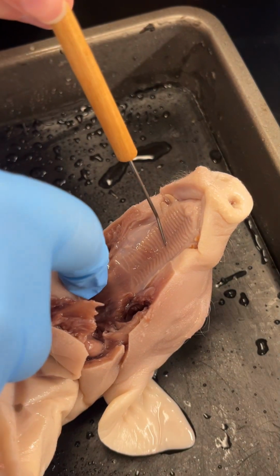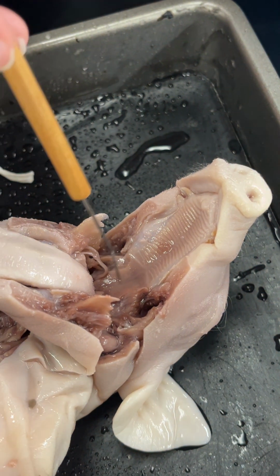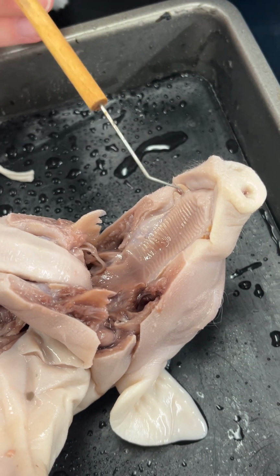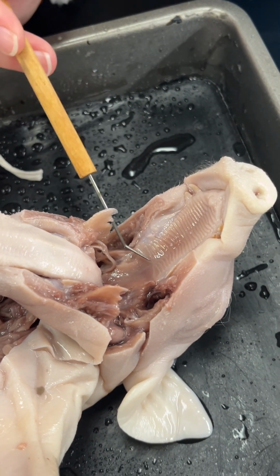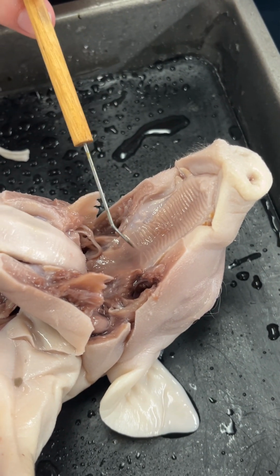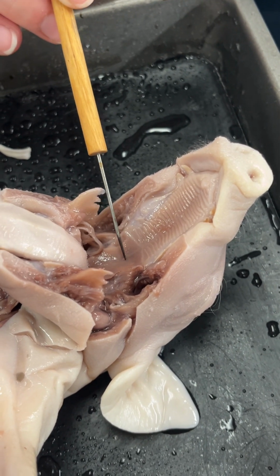This is the hard and soft palate. The roof of the mouth is formed anteriorly by the hard palate, supported by bone and cartilage, and posteriorly by the soft palate. Paired nasal cavities lie dorsal to the roof of the mouth.